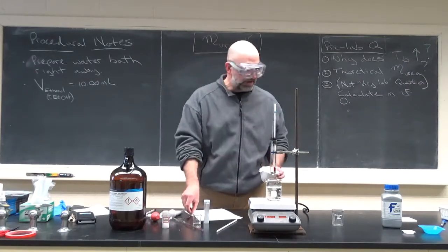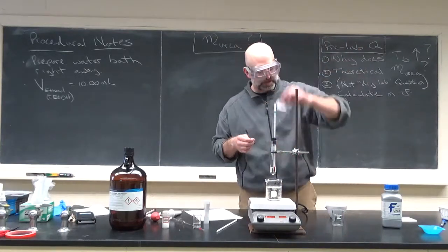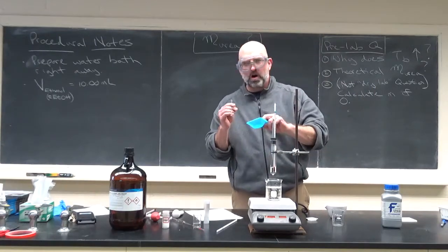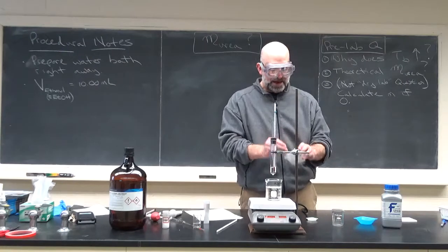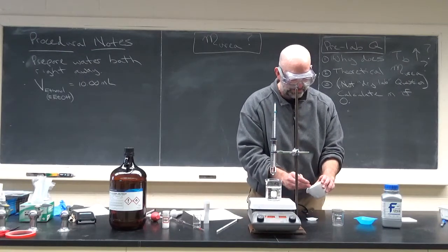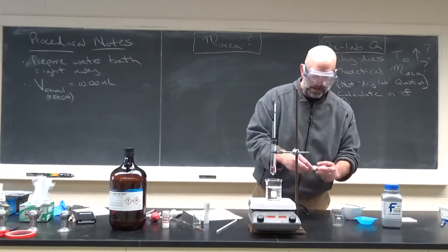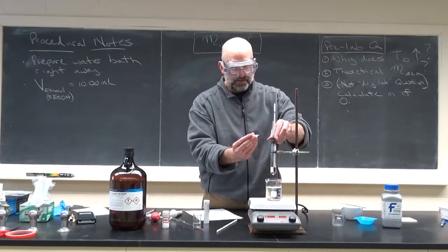The next part I think you can handle. So you use your weigh boats. I think you guys are using these little ones. I guess you could use a big one. We'll see. A gram is actually a lot, so we might put out the big ones. We'll see. So you weigh a gram out. I'm not going to weigh a gram. I think you know how to do that. And this is way less than a gram. I'm not even going to show this next part. Then you'll take this off and transfer it.